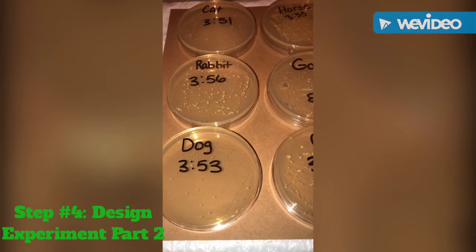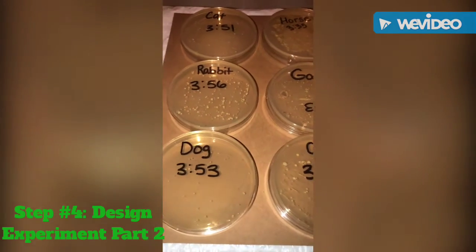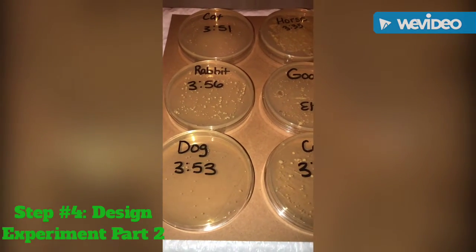So I have 8 different Petri dishes. One is my control dish that has absolutely nothing in it to be sure that the Petri dishes that I ordered are not contaminated. 7 other Petri dishes have my variety of different animals and myself's saliva put in them for the bacterial growth. This is part 2 of the 4th step, design experiment. This is how I set up my experiment.